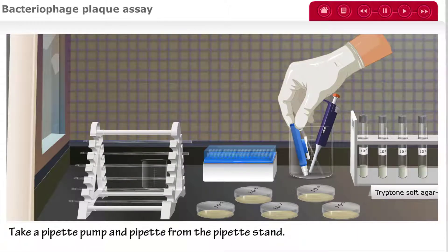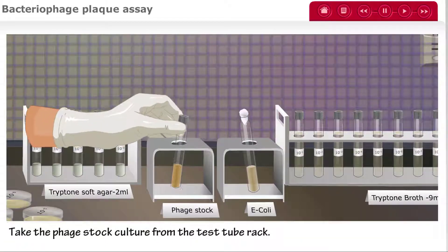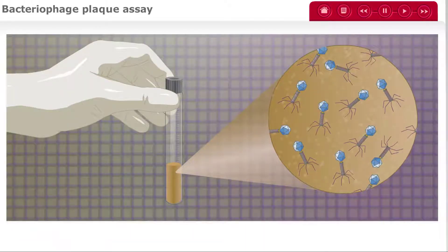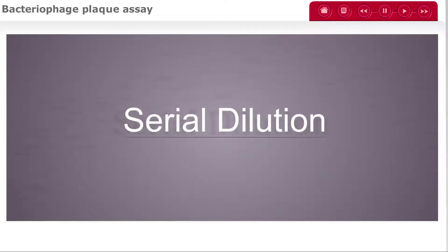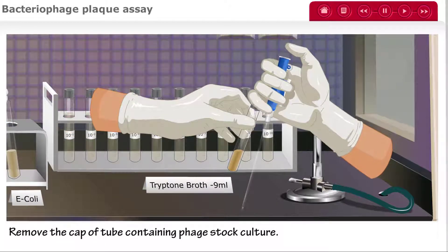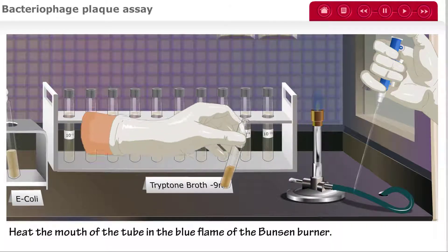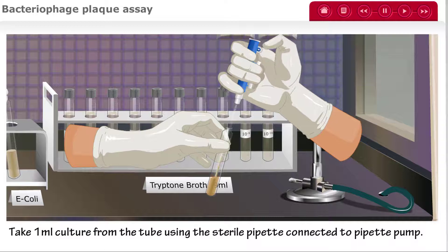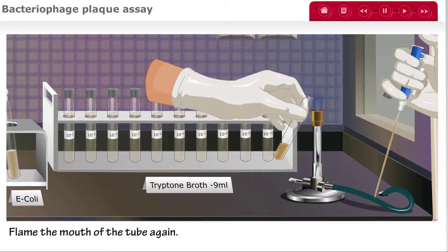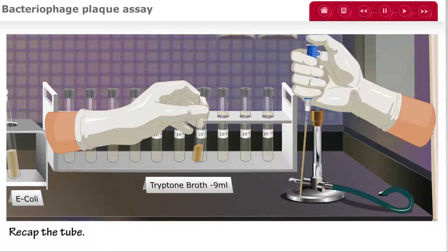To begin, take a pipette pump and a pipette from the pipette stand and fix the pipette to the pipette pump. Take the phage stock culture from the test tube rack — this contains the bacteriophages we will be using for our experiment. To perform a serial dilution, remove the cap of the phage stock tube, heat the mouth of the tube in the blue flame of the Bunsen burner, and take 1 mL of the culture using the sterile pipette. Flame the mouth of the tube once again, recap it, and place the phage stock back on the rack.